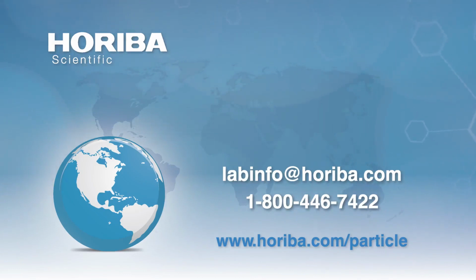Absolutely. So then, and this will be the last question before we wrap up, how many measurements are needed to get a reliable zeta potential for a sample? Well, it depends upon the precision of the measurement you want. I worked in an era when we did everything manually, although years go by and we come to automation. As a rule, I consider zeta potential to have an error of no better than 5%.